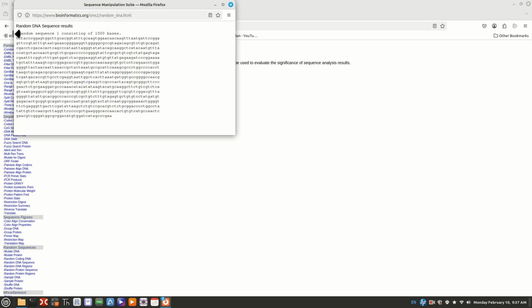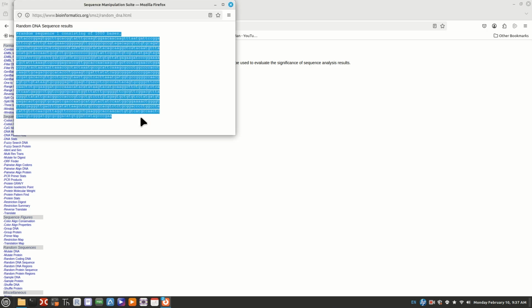And we're going to get a little FASTA here. I'm going to cut and paste this, so I grab that and press Control C. Then, instead of opening my program, we're going to open up just a regular Notepad program. The one I recommended that you download is Notepad++. You can use regular Notepad. Don't use WordPad or Word, because it'll add things to it.